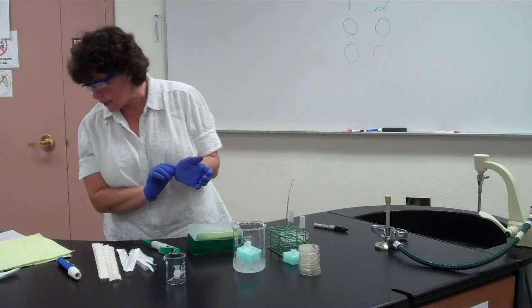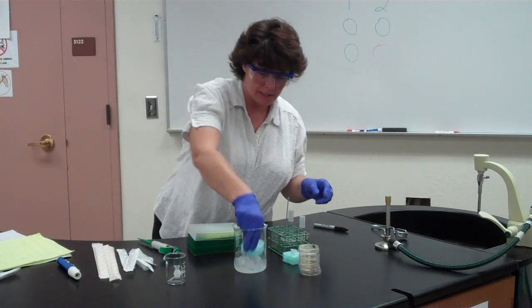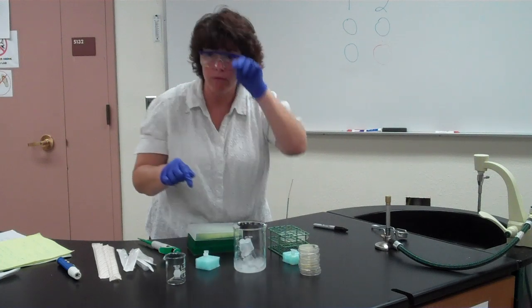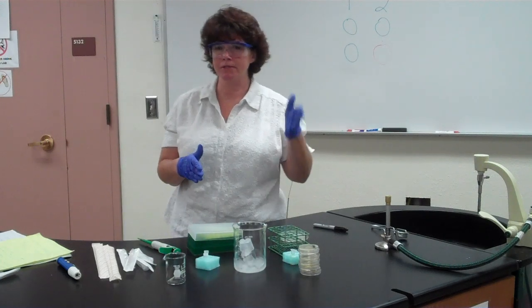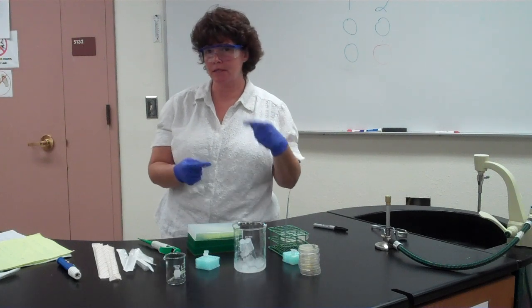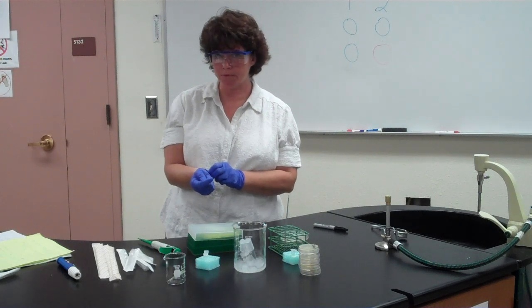Okay, now you're going to take and you're putting these guys on ice for 15 minutes. I'm not going to wait 15 minutes. However, I'm going to stop the video now and then I'm going to start again because it might end up being too long and I won't be able to post the whole thing.